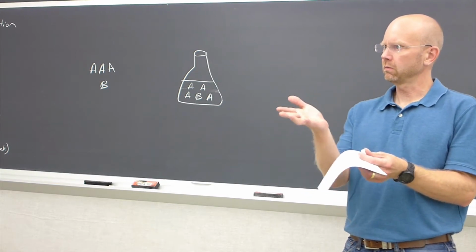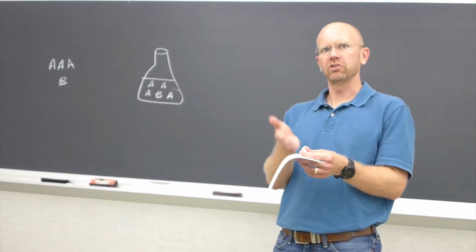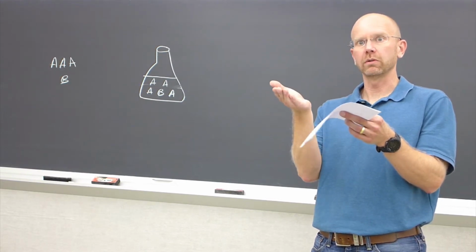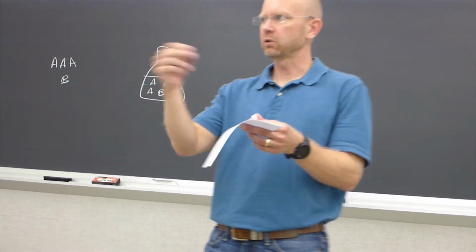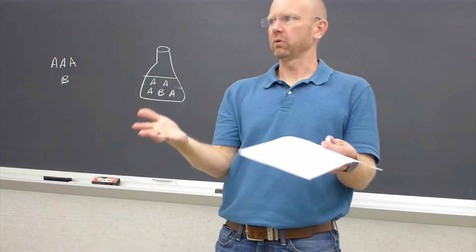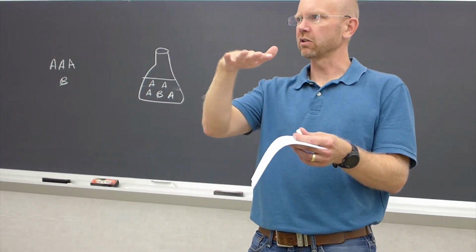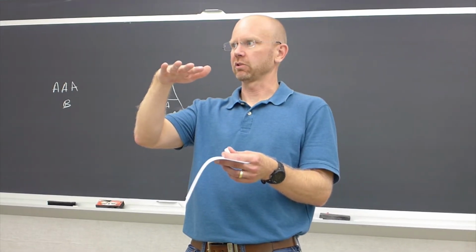Yeah, so the interactions between the solute and the solvent are good and strong, but the general trend we're looking for is that things tend to be more soluble when the solution is warmer. So the warmer the solution, the more soluble something is. If you add a solid to a boiling liquid, and you add enough solid so that no more can be added without it remaining solid, that solution is totally saturated at boiling temperature.